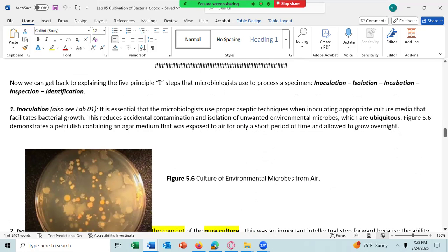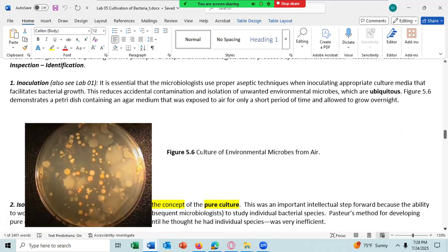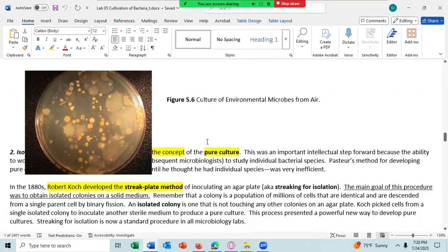All right. So inoculation is just getting a laboratory specimen from a patient and inoculating a dish to get the bacteria to grow. This looks a little bit mistaken. That shouldn't be there. It should be up there.